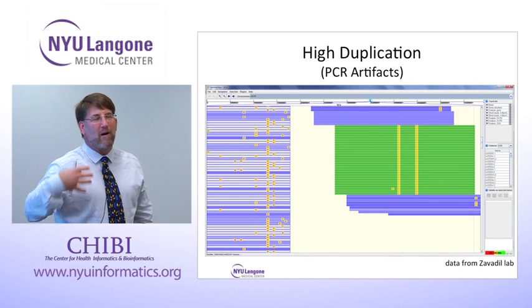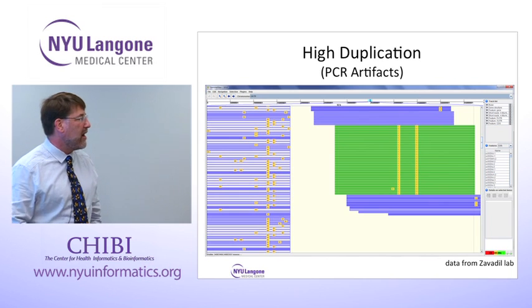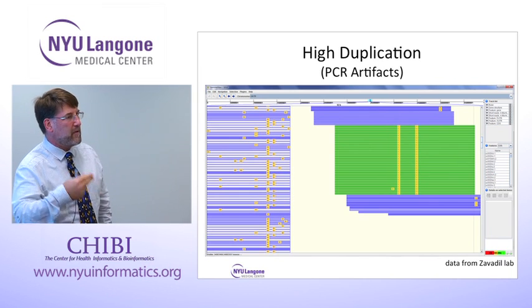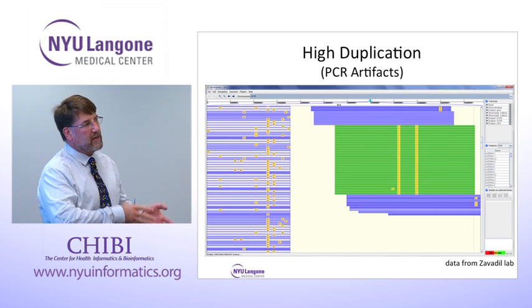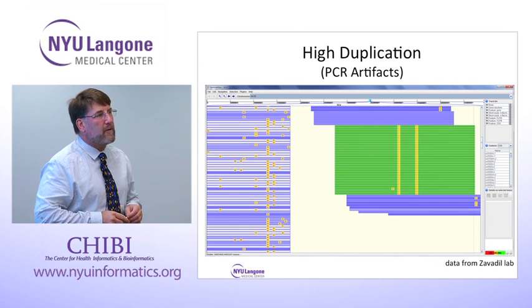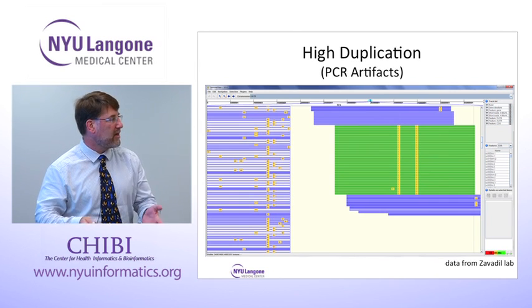I've asked myself, why can't we just eliminate all the duplicates from the RNA data? Well, there's a couple of problems with that. Problem one is you can't do that if you're also measuring gene expression. I mean, you could do it in a separate pipeline on the same data set. But the other problem is you go very deep in RNA-seq, so you have really good coverage.